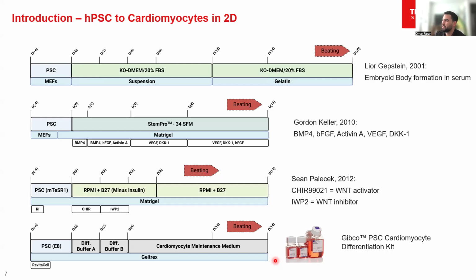Does that make sense? It really has to be an evaluation of the phenotype of the cells that you are deriving at the end. Typically, with cardiomyocytes, we look at a bunch of different markers, right? Troponin, alpha actinin. We look for beating, and then we can also look at beating rates, rhythms, and voltage changes.